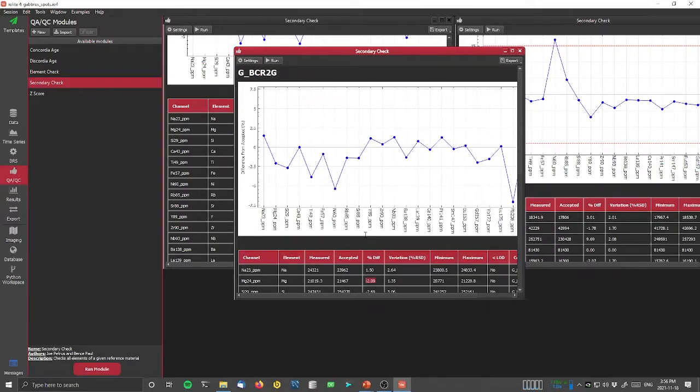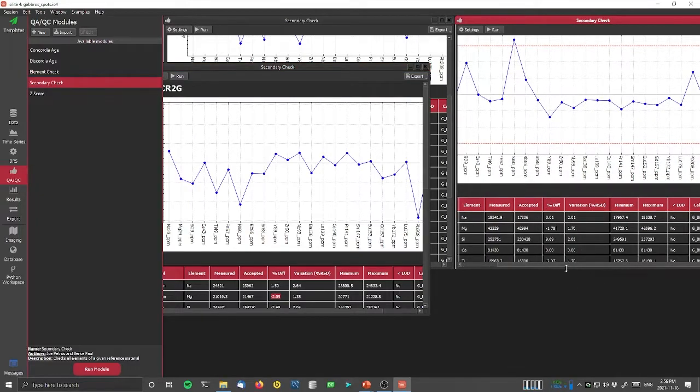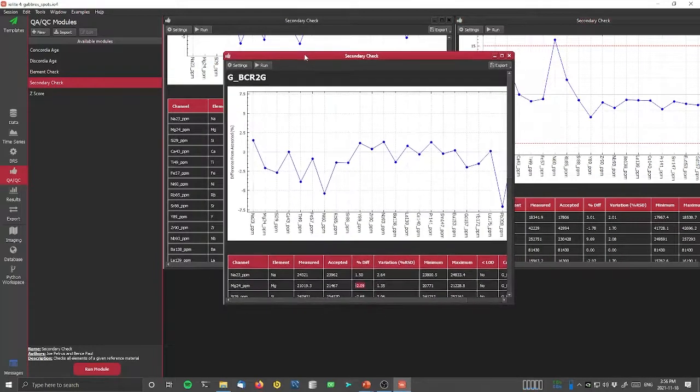So you can try that out and see what you think about it, and let us know what you think. It's important to note, I almost forgot to say, that if the residual is greater than 15% plus or minus, then it won't apply that, because what it's saying here is that we're actually not getting a great result for nickel. Let's not make it even worse by applying some large residual. So if the residual is greater than 15%, then it won't apply that correction.